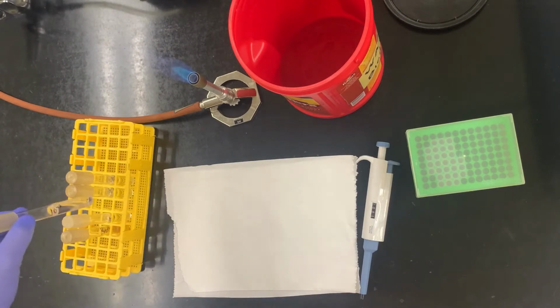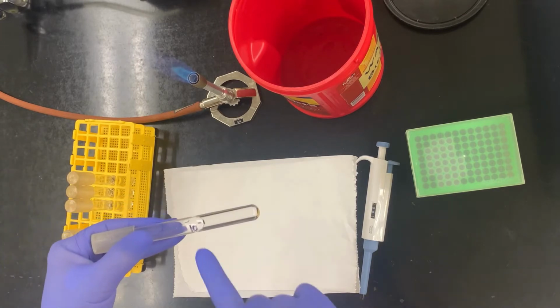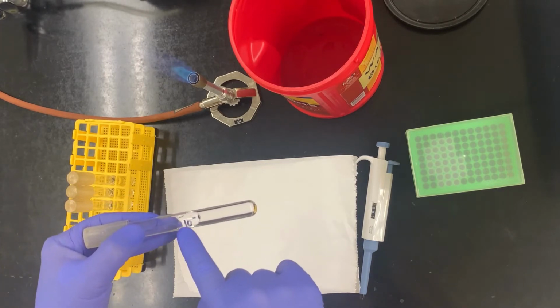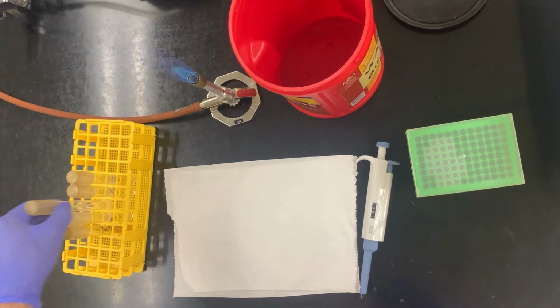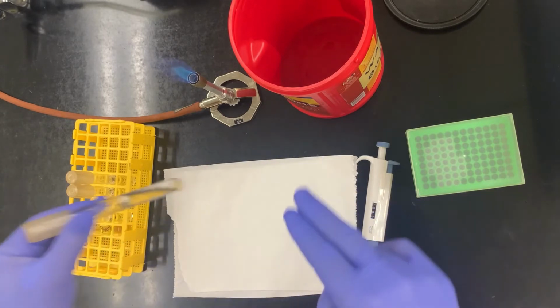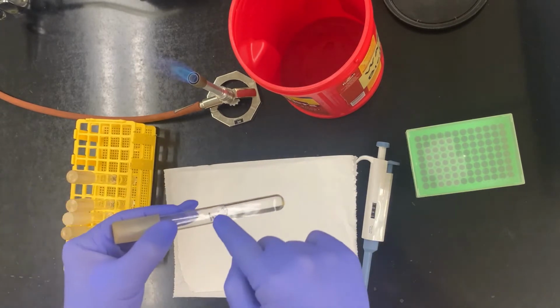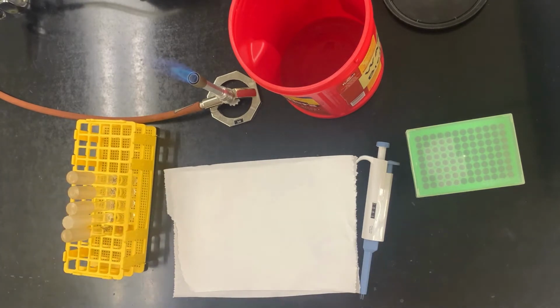We'll talk exactly about what these labels mean, but right now the easiest way to think about this is minus means smaller. 10 to the minus 1 is 1 ten less than my broth. 10 to the minus 2 is 2 tens less, so that's 10 times 10, that's 100. 10 to the minus 3 is 10 times 10 times 10, 1,000 less, et cetera. Or the ultimate simple way to think about this is just first tube, second tube, third tube, fourth tube, as long as you know what happens as we go down each tube.